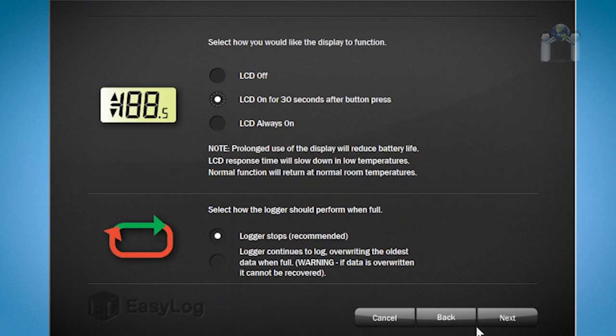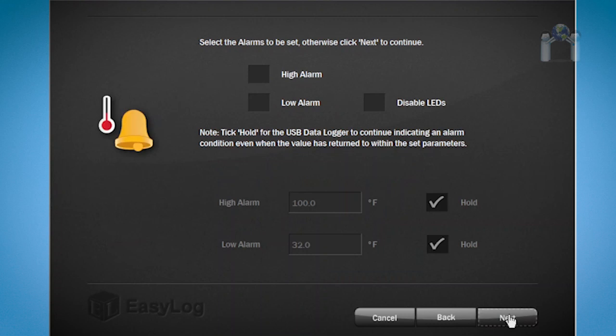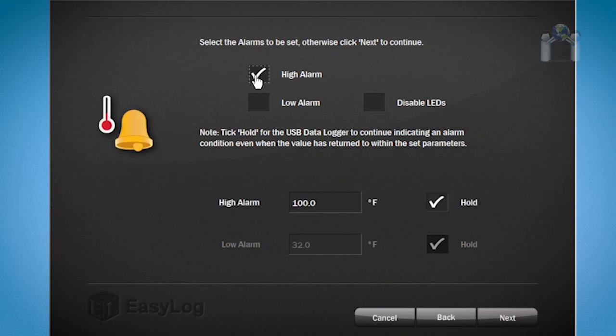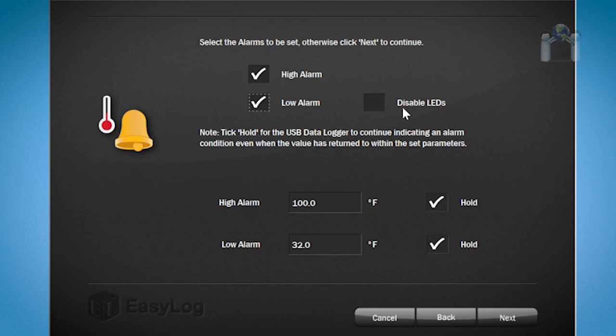After clicking on Next, you will see the temperature alarm settings. You can choose to set a high or a low alarm by clicking on the box next to the alarm. Check both boxes and you will be alerted to both. Just to the right is a box with an option to disable the LEDs. If disabled, the LED lights will not show the status at any time. I am going to leave it unchecked.